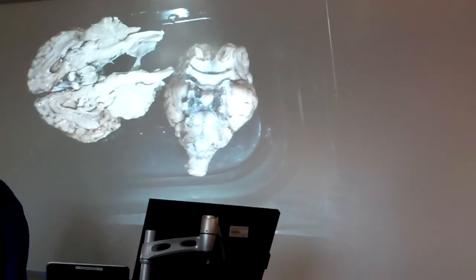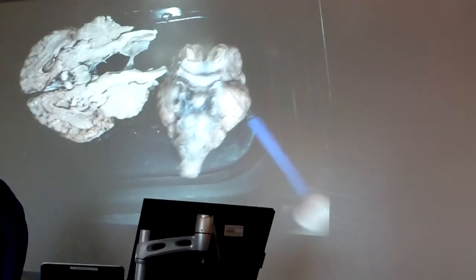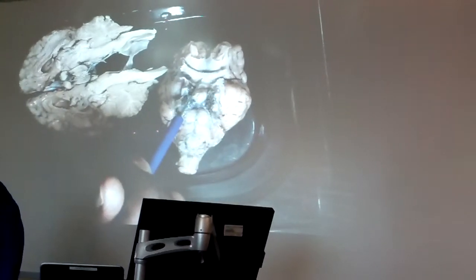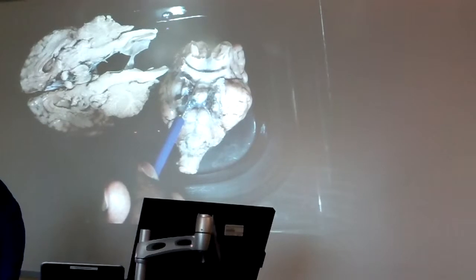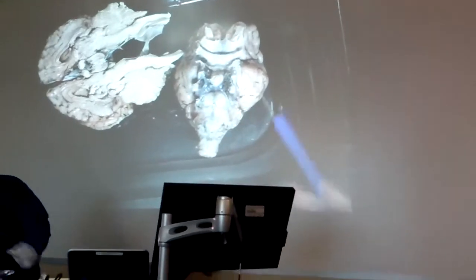But Mr. Gilmore, if that much is true, what is the optic? The optic is this cute little fella right here. This is the optic nerve. If these are the optic nerves, what's this area where they cross? That's going to be called the optic chiasm. The optic chiasm. Now, where is the optic tract? The optic tract is going to be underneath this structure. You can't see it. But if you pick this up, you'll be able to see it.